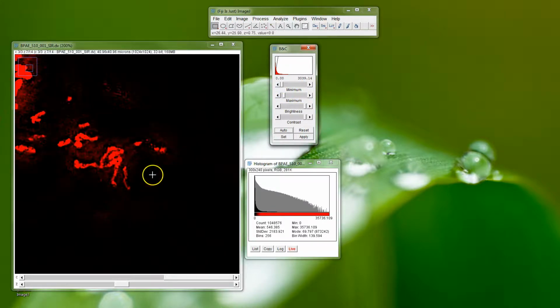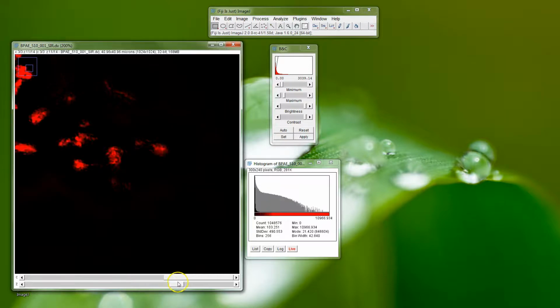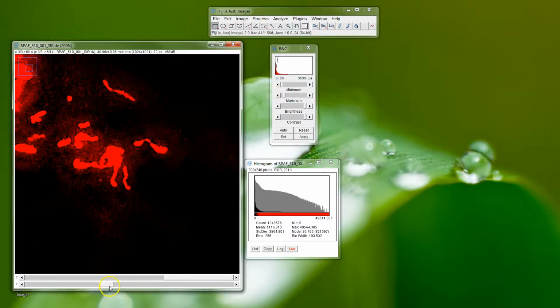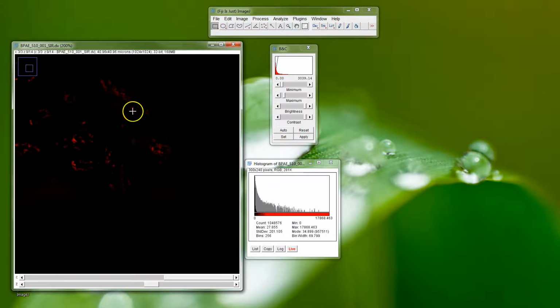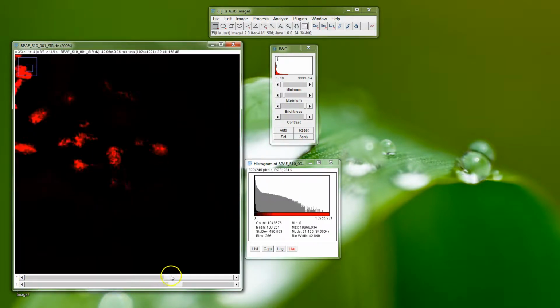Let's zoom in on some of this. Have a little bit of honeycombing going on and a few kind of rings coming out and around. Sometimes you can see hexagonal ring structures. It's a little bit more difficult when you have some random shape structures. When you have punctate structures, it makes life easier to see what's artifact and what isn't. So we go to the brightest level, and as we move a couple of levels up, we can start to see these shadows of the data sets either side. The oil's a little bit less symmetric on the red. You're going to find one of them is going to be a little bit better matched. It's hard to get right in between.